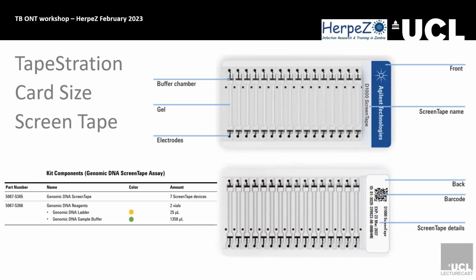Oh wow. Yeah, and I think it's under $100. Oh, brilliant. So that's $400 for $100 a sample. That's very cheap. Yes. And then it takes about 4 minutes per sample, and you can also take plates. The machine itself is 29,000. 29,000, and the TapeStation. Okay, so that's also something which one can consider.